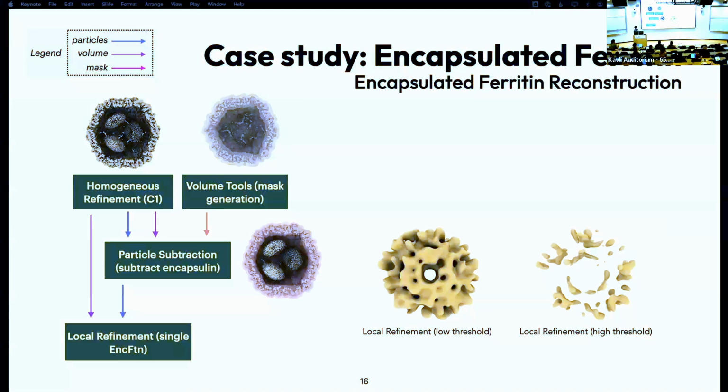So instead of being stuck below 10 angstroms, we got a claimed resolution closer to about 7 angstroms. But the map shows quite a bit of overfitting artifacts. And these are shown in the figures in the bottom right. The map at a high threshold shows that the strongest density regions are mostly just streaks going out radially. And Rich said in both 2D classification and in 3D, you'll see oftentimes these radial streaks. They're a very telltale sign of overfitting. And if you see them in your map, it's very likely artifactual and not real.